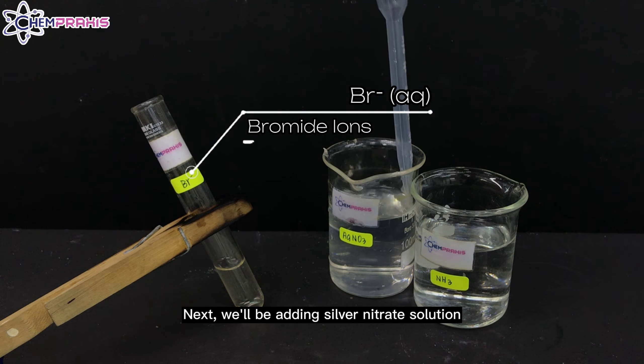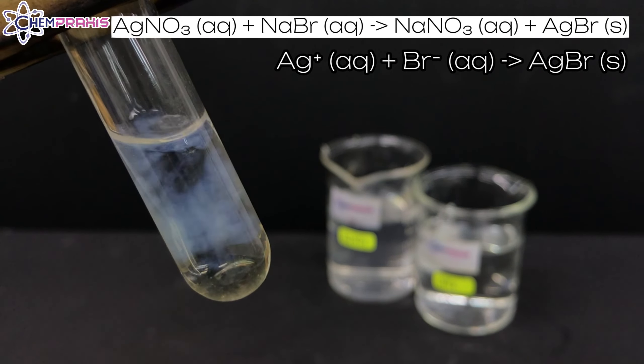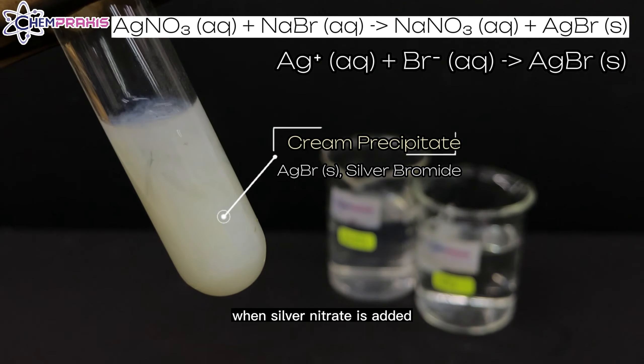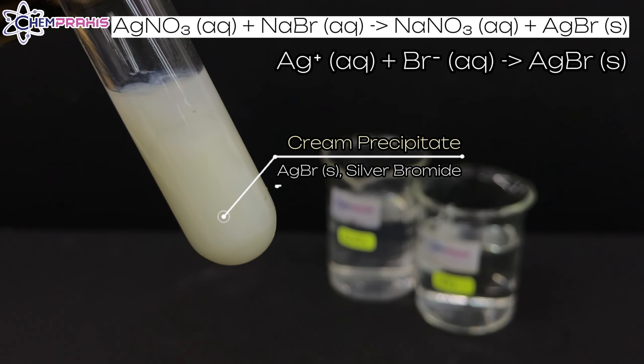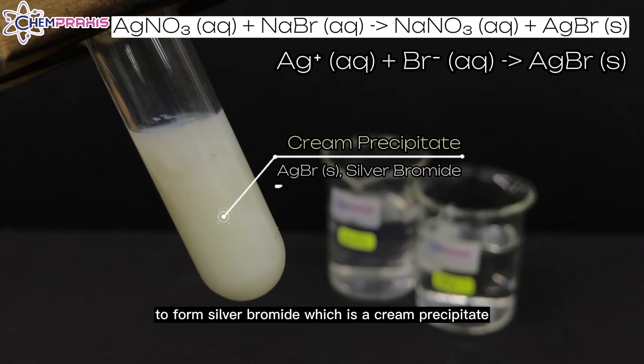Next, we will be adding silver nitrate solution to the bromide ion solution. When silver nitrate is added, a cream precipitate forms. The silver ion reacts with the bromide ions to form silver bromide, which is a cream precipitate.